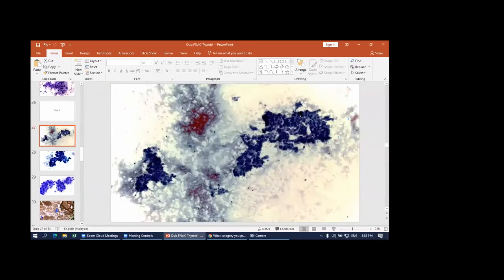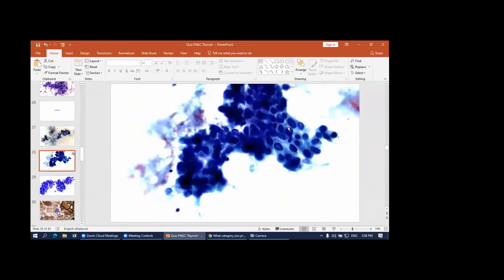This is a similar cluster that we see before, kan? It has some architecture as well in the PEP. But basically you can see there's a lot of overlapping. The nucleus is not that similar all over. You can see some inclusion there and there.